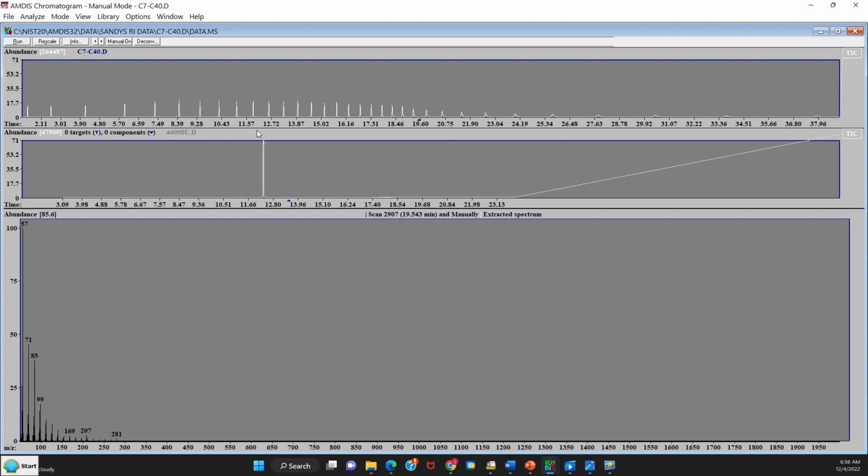We have our analyte that falls somewhere between the C17 and C18 hydrocarbons here. And you'll notice there's a little artifact here, as I noted before. That's because there was no need to run the analyte all the way to the end. So we stopped the temperature program here and stopped the file to save some time. But it gives this artifact where it just shows a rise in the baseline.